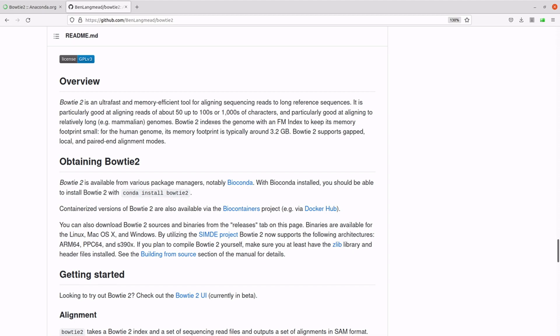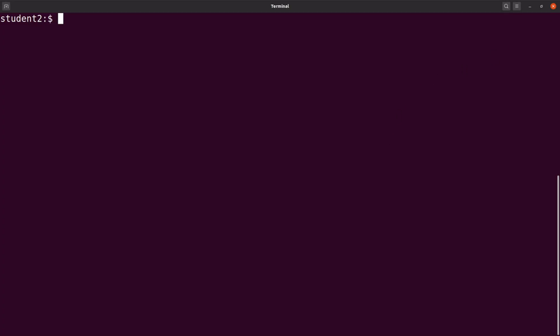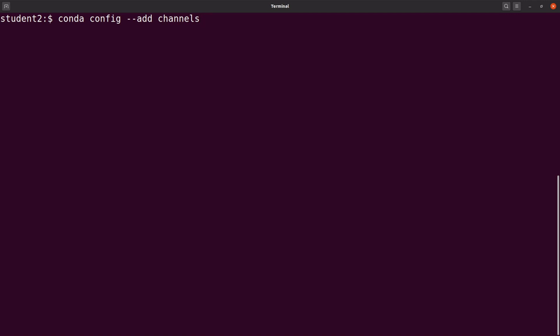Once you are done, you can install Bowtie2. So let's go to the terminal and install. Before you install, you need to make sure you have added Conda channels. We will add two channels here. So we say: conda config --add channels.